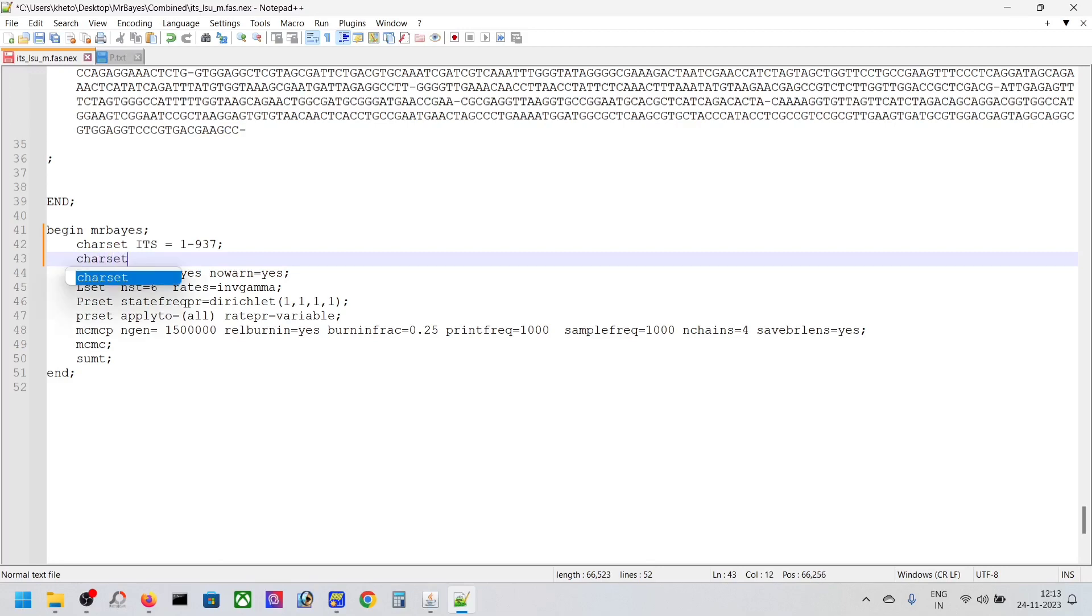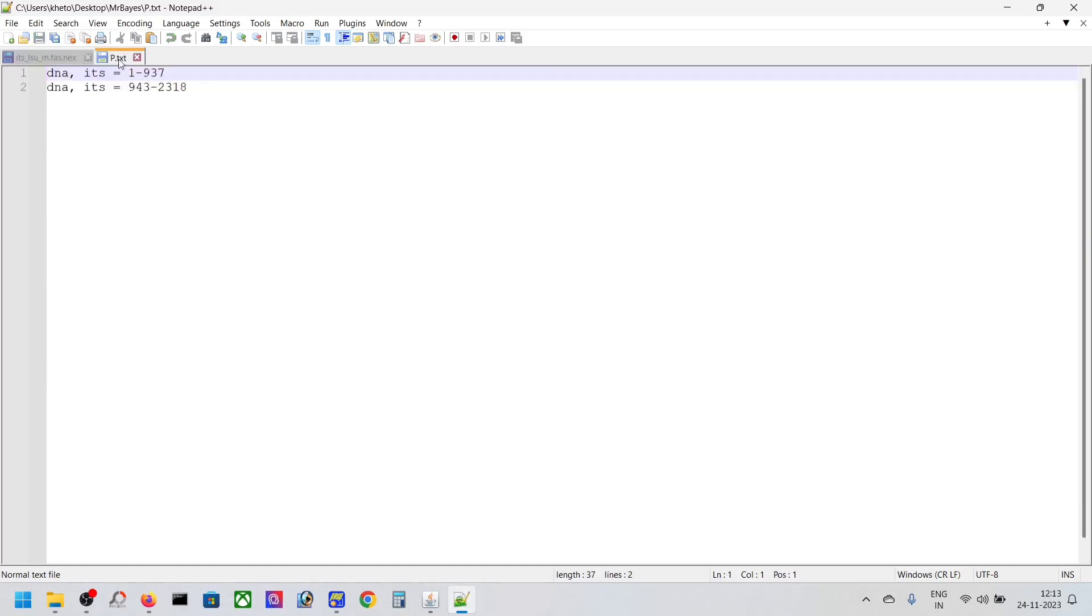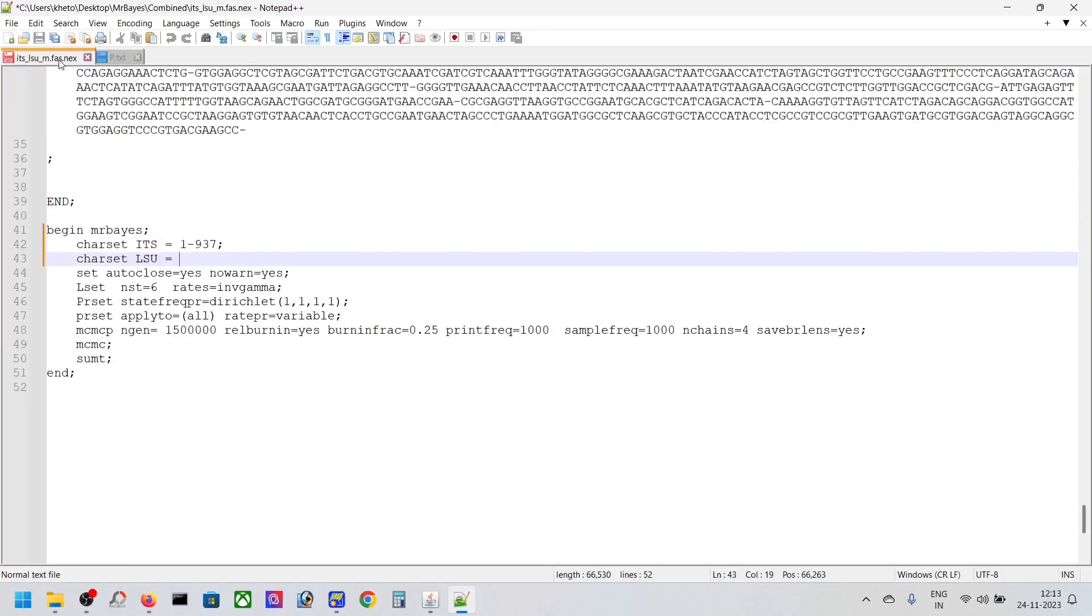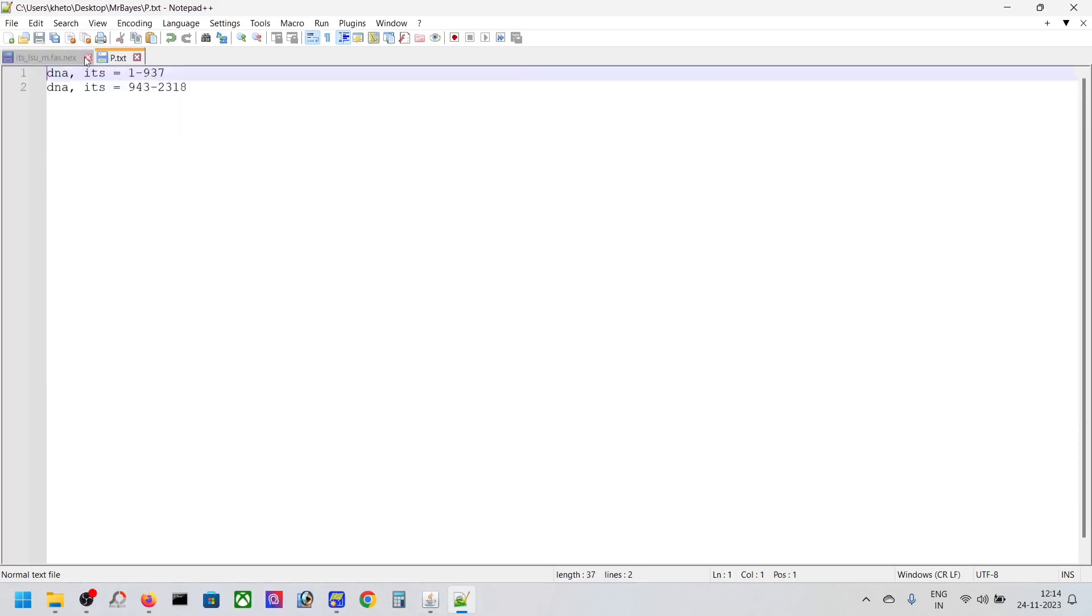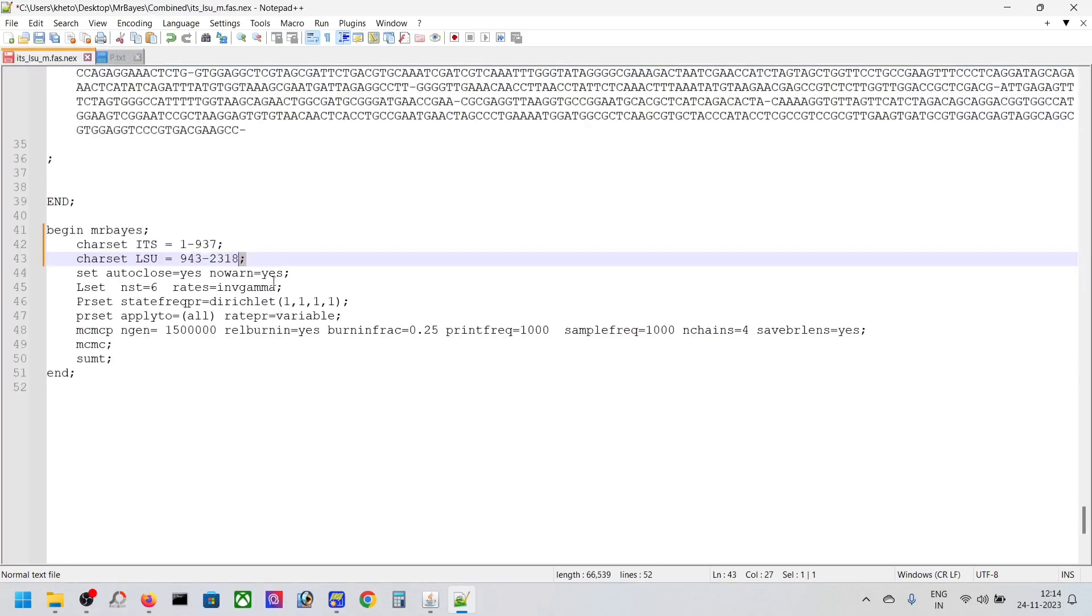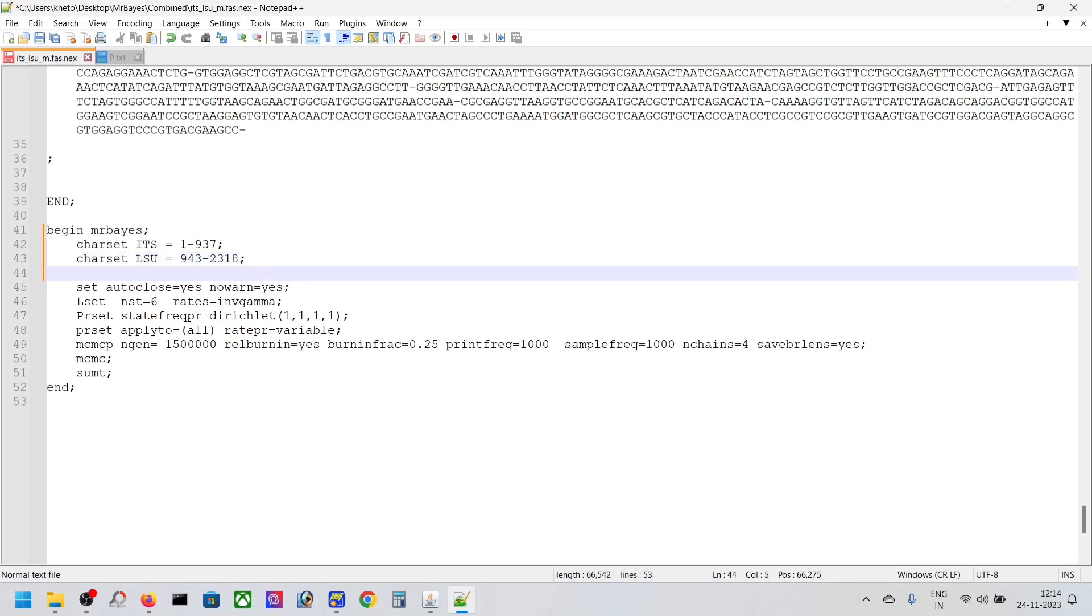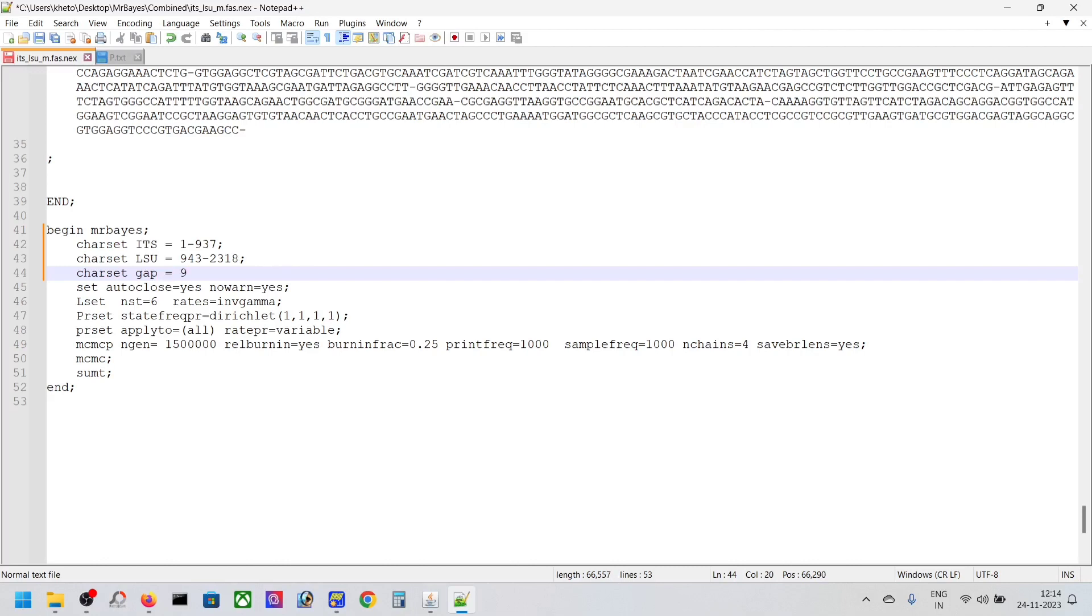Character set LSU equals our partition from 943 to 2318. Don't forget the semicolon here. And another character set is GAP that we made, which comes from 938 to 942.